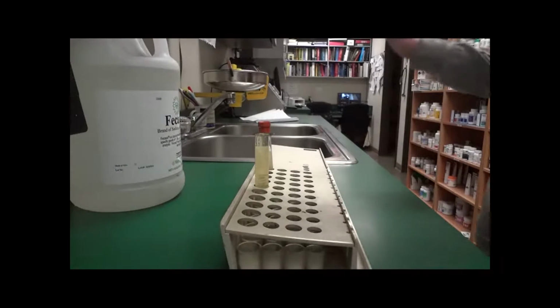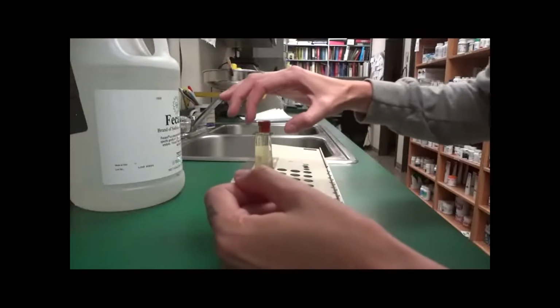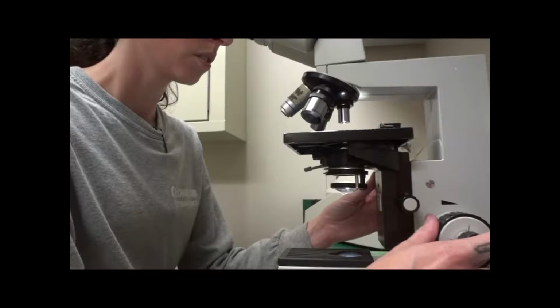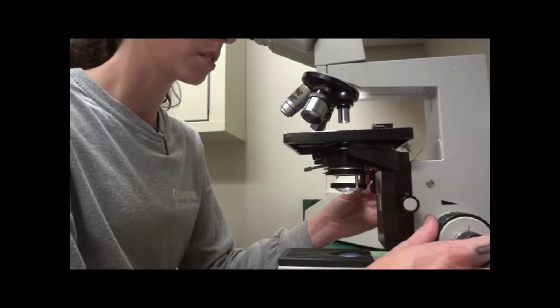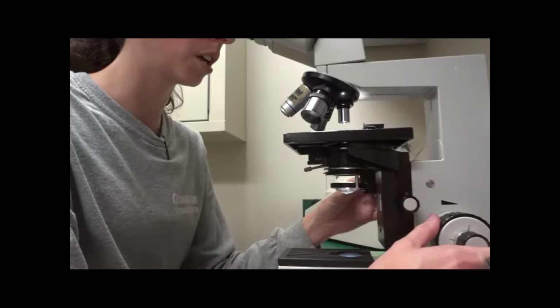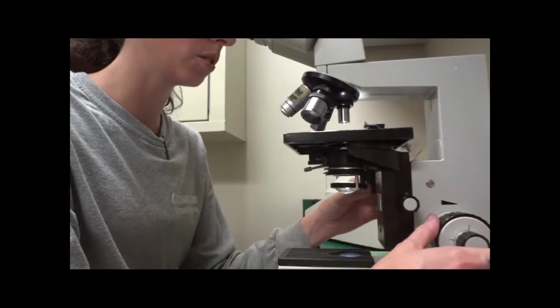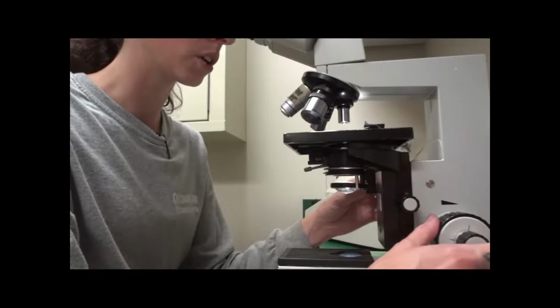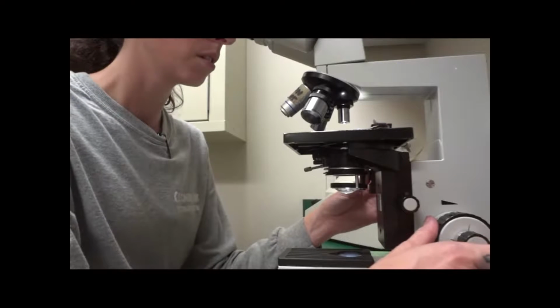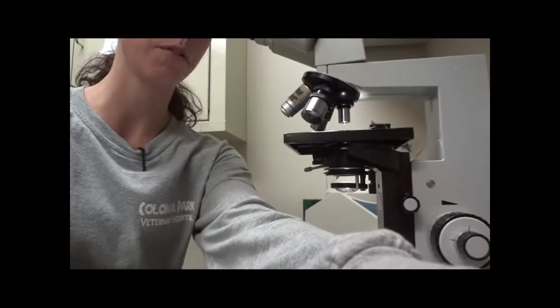Alright, we've allowed our fecal to sit for 15 minutes. We will take the cover slip and apply it to a microscope slide. We did observe this fecal through a simple fecal flotation earlier, and it came back positive, which is why I'm using it for my sedimentation and centrifuge fecal videos, so that I know whether I've done it right or incorrectly. It was positive for hookworms. That's how you do a fecal through centrifugation.